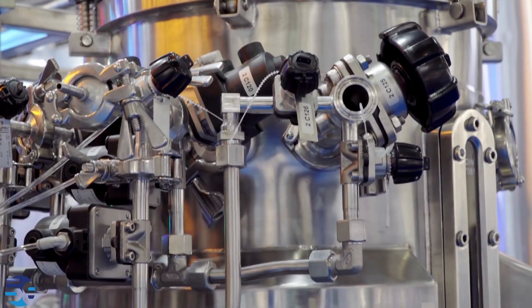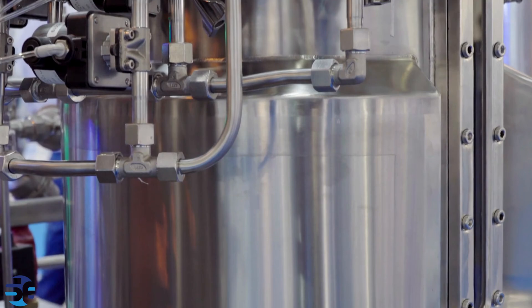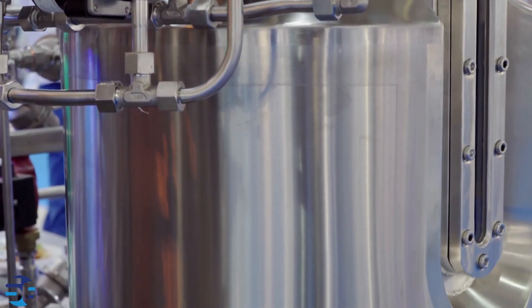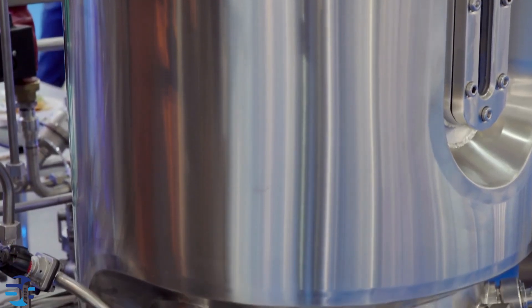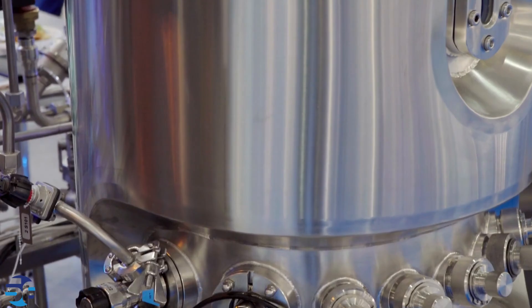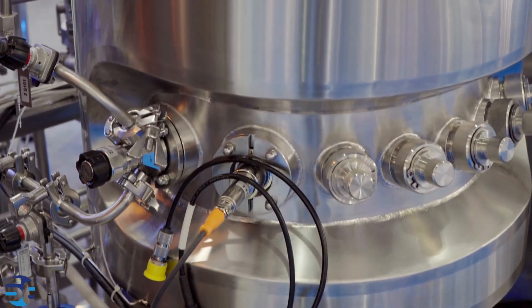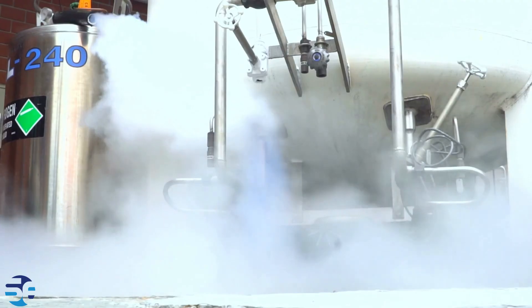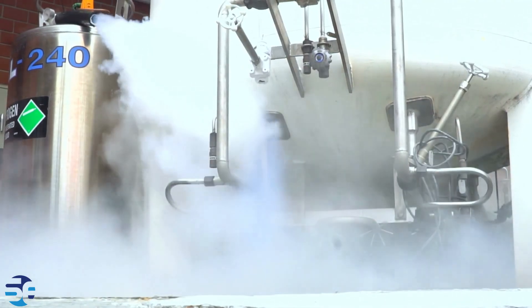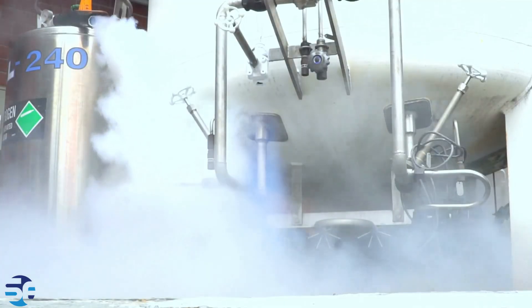Let's discuss the design and construction. The reactor is typically made of high-quality materials that can withstand high pressures and temperatures, such as stainless steel or other alloys. It consists of a sealed vessel that can be pressurized using a gas, liquid, or mechanical means. The reactor is equipped with a pressure control system that allows the user to adjust and maintain the desired pressure within the vessel. Pressure can be generated using gases like nitrogen or through hydraulic systems.